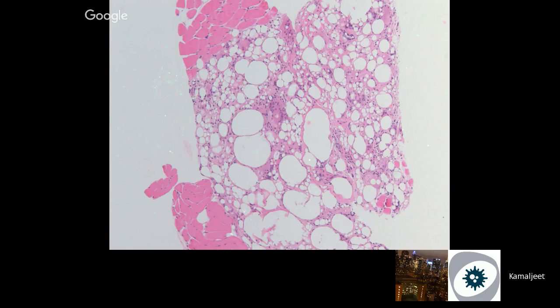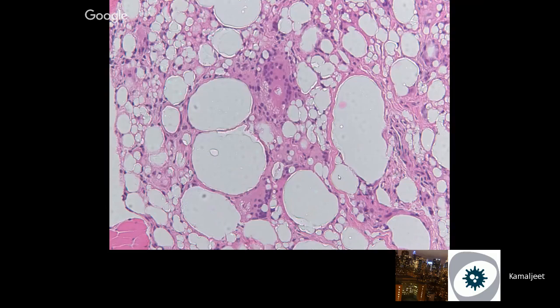I don't know if you have seen a case of silicone mastopathy. Basically what it looks like is you have skeletal muscle and you have these variable size round spaces, which look like lipocytes, adipocytes, or lipoblasts. And there might be giant cells and histiocytes. So the key is you flip your condenser and the things will look refractile. So that's the implant material. The giant cells can have asteroid bodies in this.